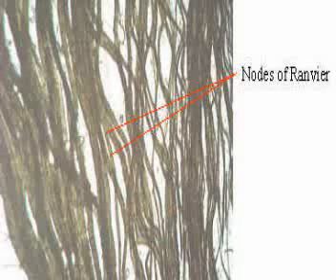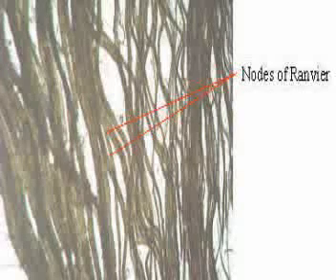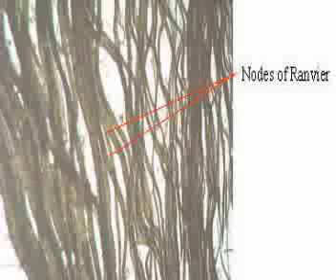These nerves can be easily confused with the cross striations of striated or skeletal muscles, which are seen in very high magnification and therefore can be distinguished. And we also have darkly staining nodes of Ranvier, which are clearly visible on higher magnification on nerves. Differential diagnosis. These nerves can be easily confused with striated muscle and tendons, but striated muscles have cross striations and tendons are clear without nodes.